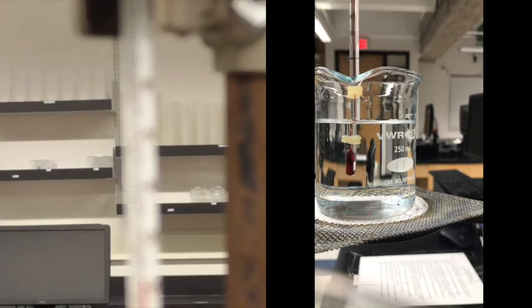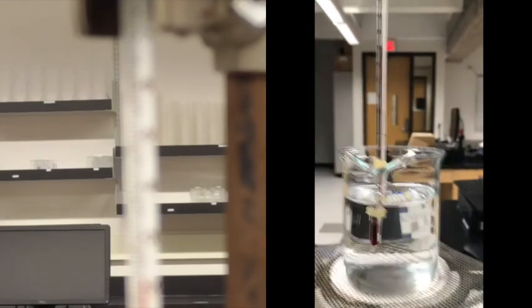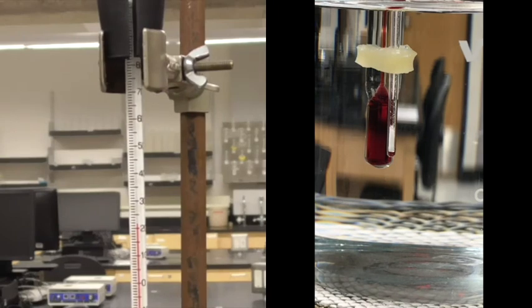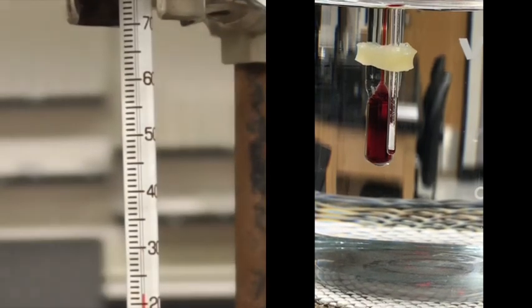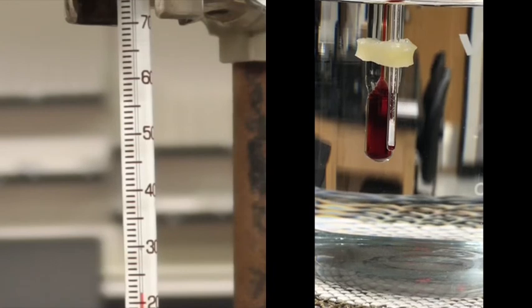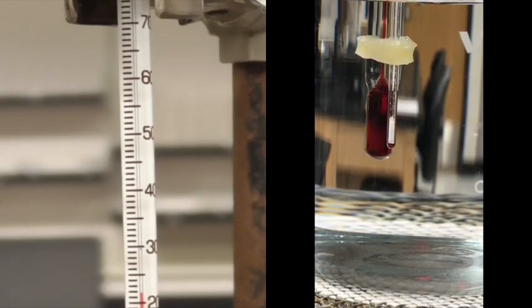Make sure everything's set up here okay. Alright, so I think I'm set up. Oh, gotta zoom in and back out and go in. Okay, so you can see we're somewhere between 20 and 25 right now, so I'm going to get the Bunsen burner going.